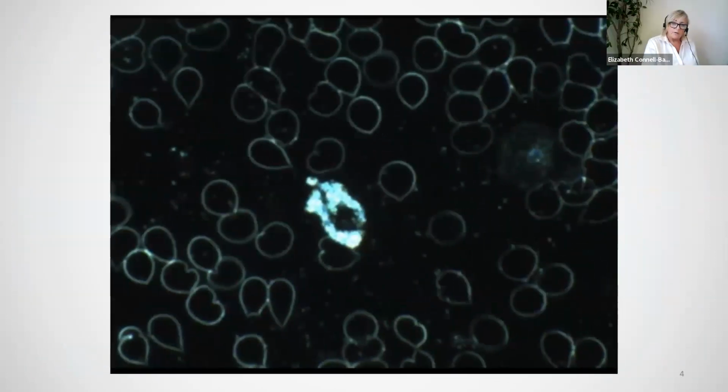So you wouldn't see those with an inferior microscope then? Yeah, absolutely. So you can compare that image to the image on the screen now. And again, you can see the outlines of the red blood cells. We can see the bright structure in the center. There's a white cell. There's actually another white blood cell in the sort of upper right-hand side here. Quite a faint structure there, but that's actually a monocyte.